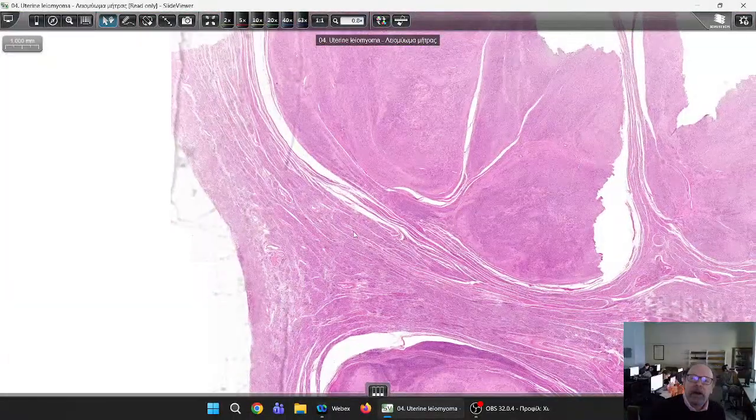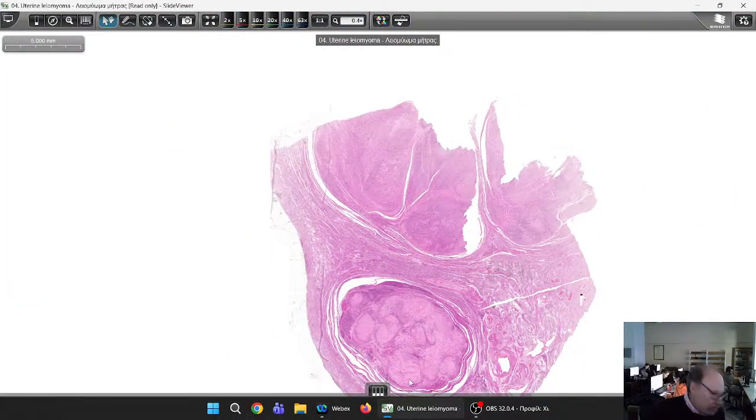It's just the same. However, you can see that this is a tumor, and if you put it under the microscope, you cannot tell that this is a tumor because it is fully differentiated. It looks like normal myometrium, but you have the macroscopic evaluation where you see that this tissue forms nodules. So you can understand that this is a tumor, or at least a tumor-like lesion.